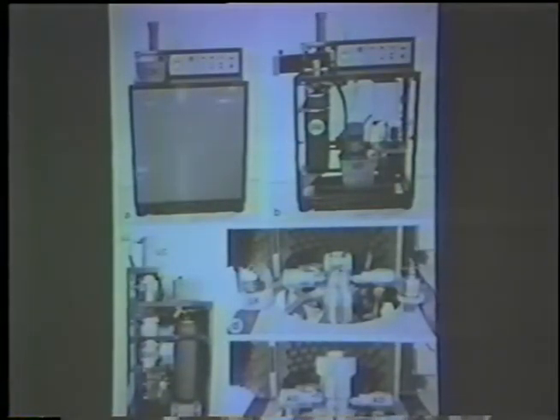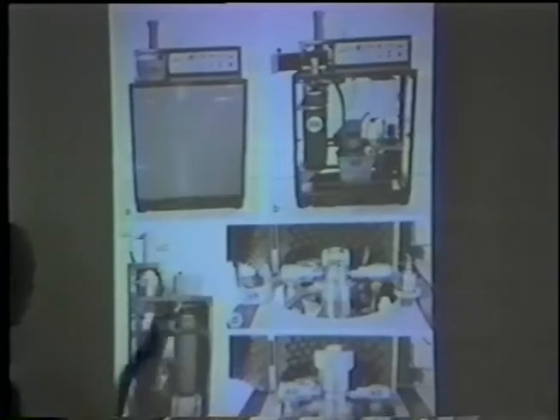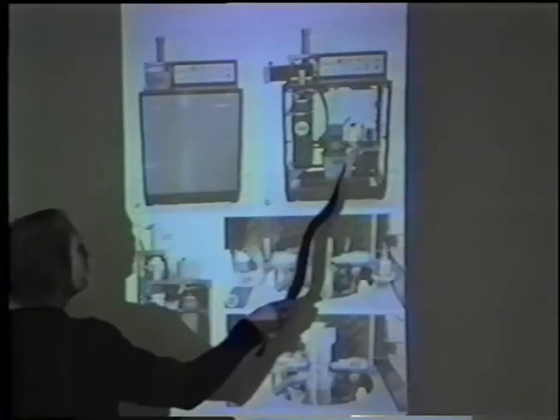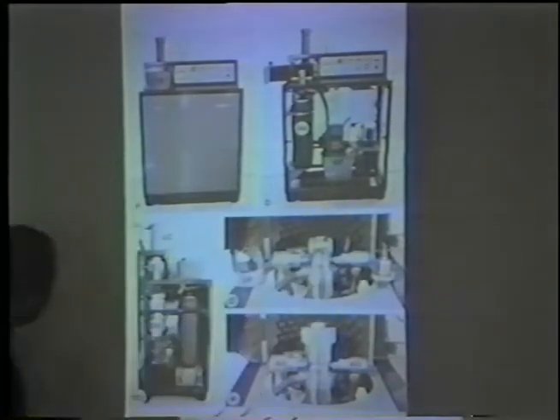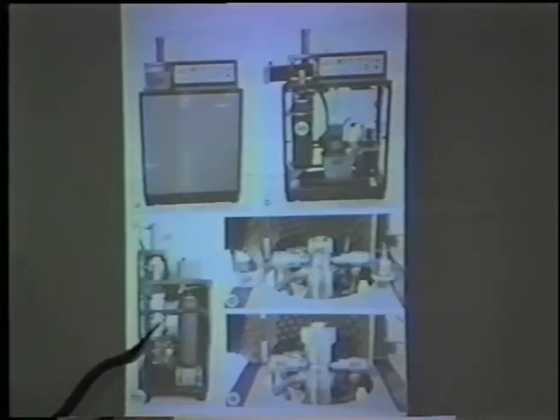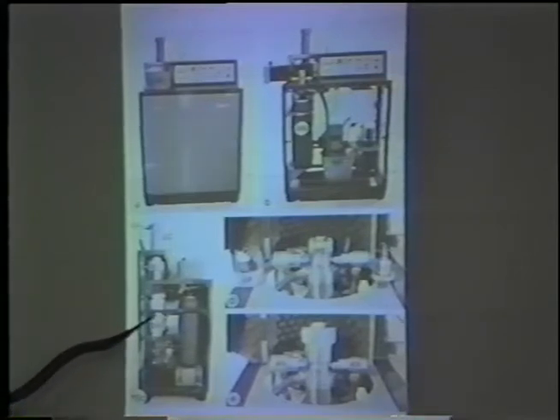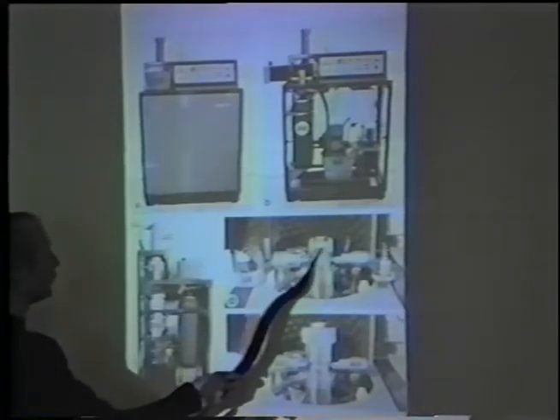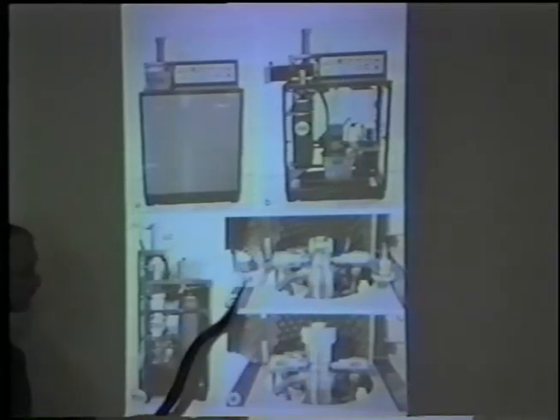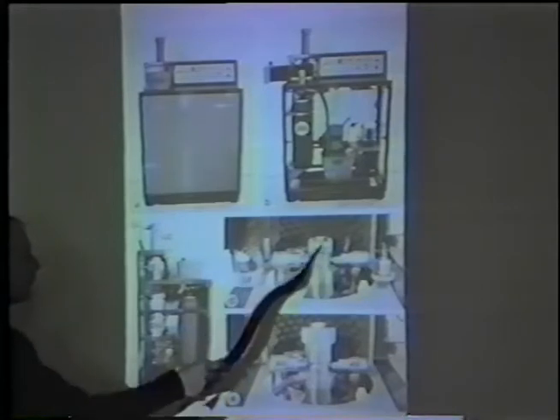These are photographs of the device itself. It's about 5 feet high and 3 feet thick and 5 feet wide. And this is the freezing chamber, the sample chamber. And this is the pressure accumulator. This is the oil pump. This is the low pressure side of the cylinder and the low pressure line coming in. This is the dewar vessel containing the high pressure cylinder. You can't see it in here, but there are the high pressure lines coming up to the sample chamber. This is the actual freezing chamber itself. This is the sample holder with its little leaf open. This is the locking ring. You put the sample holder in here, and you put this locking ring in here.